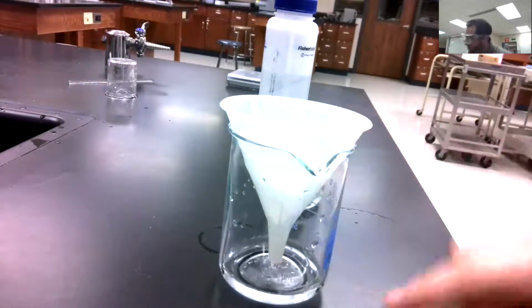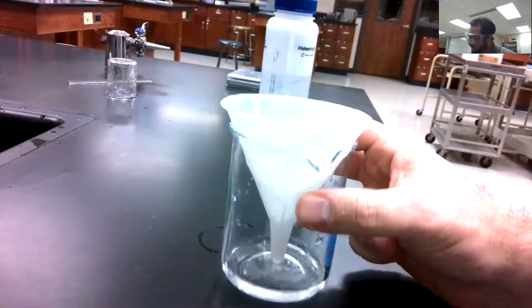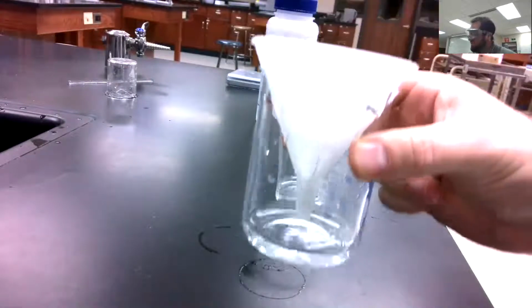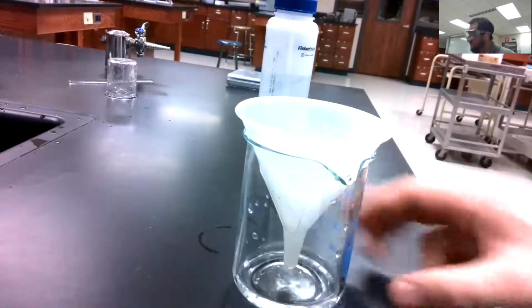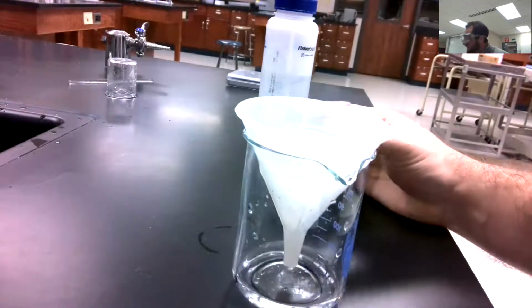And again, we've done a good job so far. We can tell our water is still clear here. It's coming through, so we know that we haven't lost any product, or we probably haven't lost any product. We'd have that kind of white murky color down there if we had.